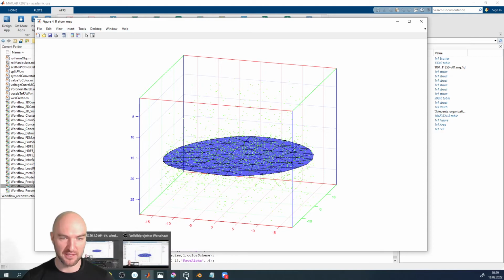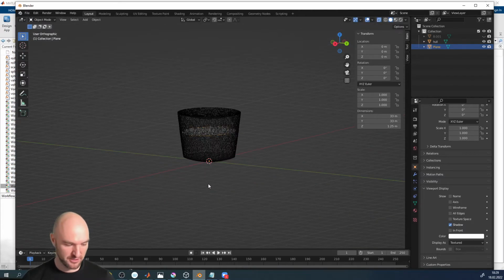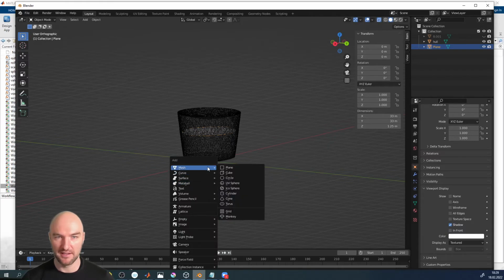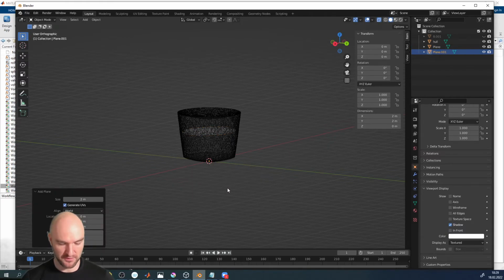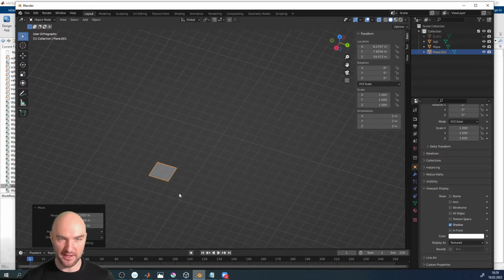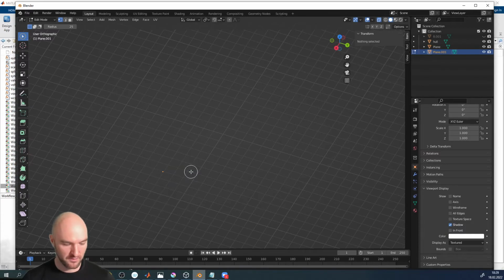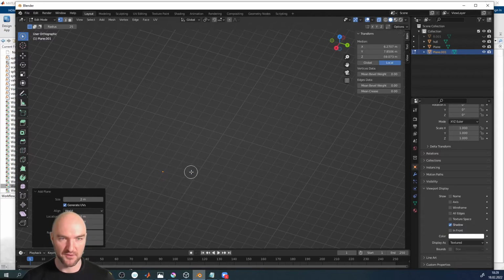This was just modeling of 2D objects, but of course you can do the same thing with 1D objects. So if I go back into Blender, I'll just add a new mesh and just pull it off somewhere into the middle of nowhere, just because I want to show you some stuff. It can do the same thing, and we have algorithms in there to deal with that. In this case, I'm just going to delete all of the vertices. Sorry, that was stupid.